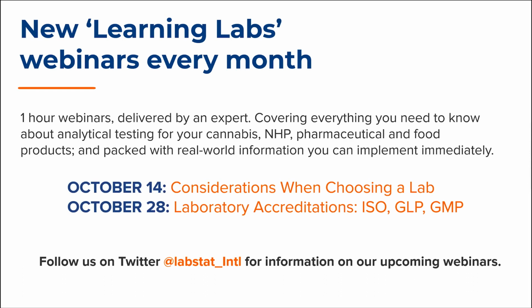Okay, guys. I do. How do these validated methods transfer to microbial testing? Microbial testing is kind of a different beast in that you're validating the pathogens of interest for your particular matrix. So typically what's done there is you have a suitability test.